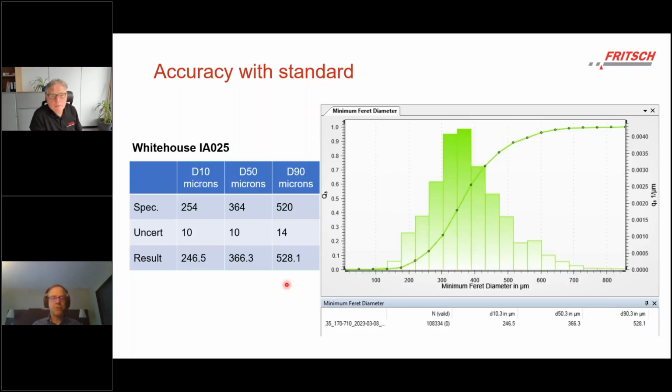There are tools for this, called a drum thief, for that example. And then you'll need to split the sample with a riffler. Whitehouse has done all that for us, so this is a great check standard. So your accuracy depends. If you get me a good sample, I can do very, very well in terms of accuracy, and we can help ensure you get a good sample.